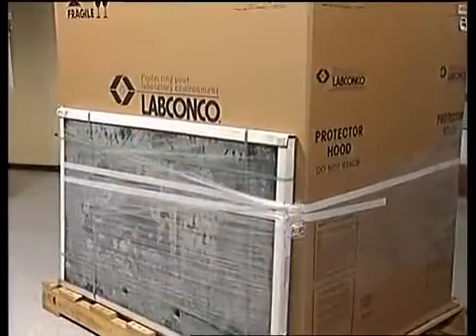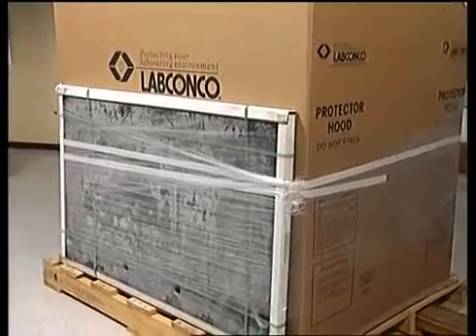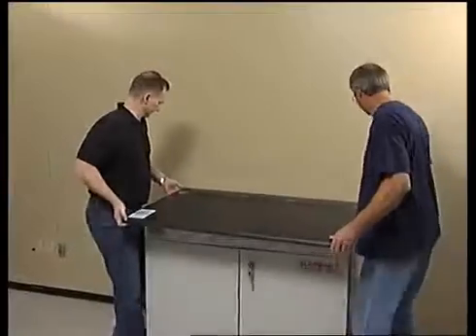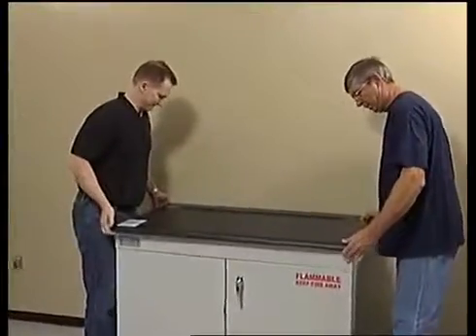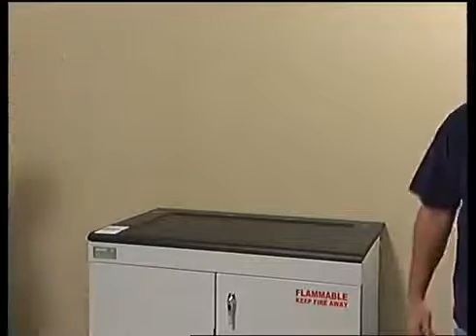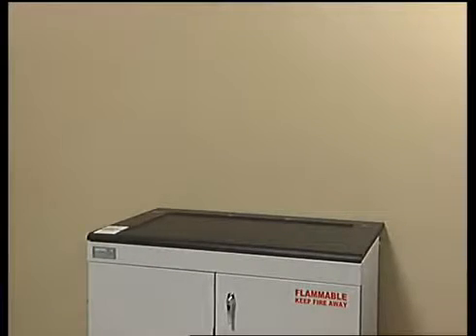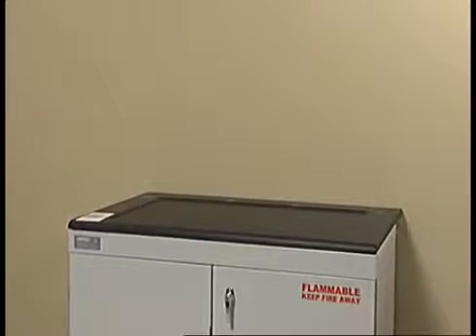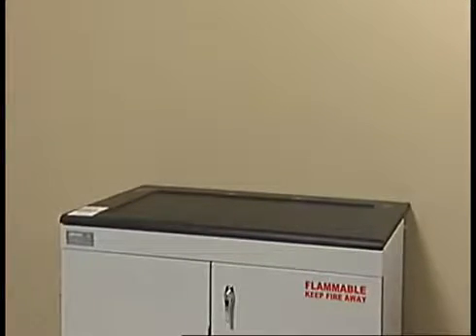When a fume hood and work surface are ordered together, the work surface is shrink-wrapped to the fume hood carton. Place the epoxy work surface directly on the top of the cabinet structure. Align the front edge of the work surface with the front face of the cabinet. If you wish, you may seal the work surface to the base cabinet by applying a bead of RTV sealant to the cabinet top prior to setting the work surface.